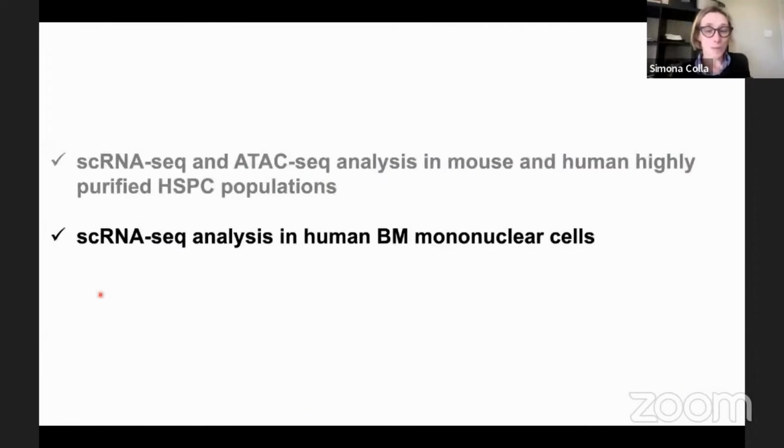The second part of my talk is about the analysis of mononuclear cells, which in a way seems to be easier, but honestly is not.